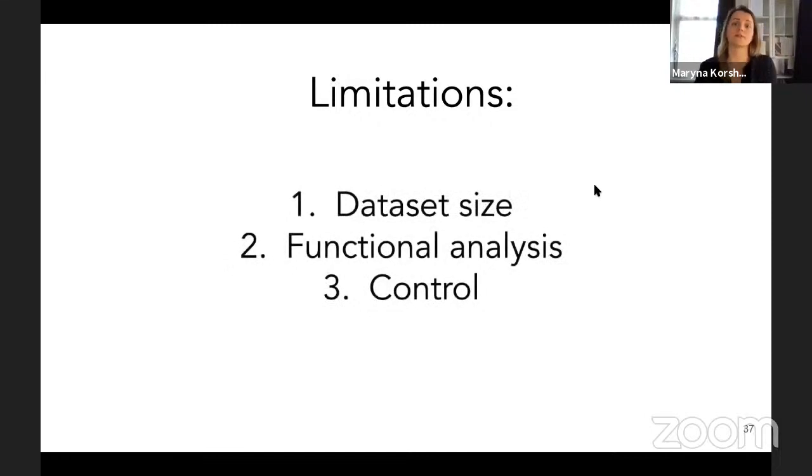First of all, is the size of the data set. As you might see on the previous slide, the size of the data set influences the time of uploading and processing. So imagine that if it's a web-based tool, it will take an insane amount of time if it's a huge data set, or it will be simply rejected.